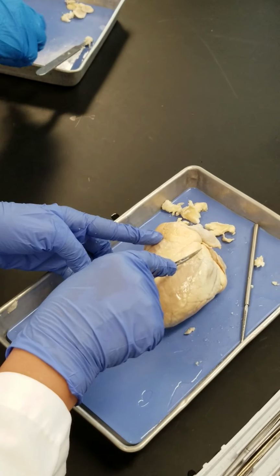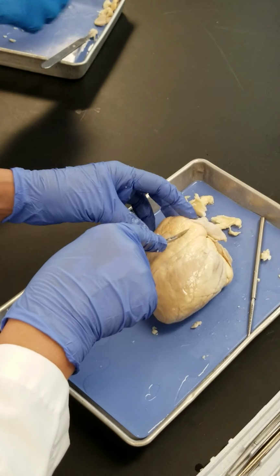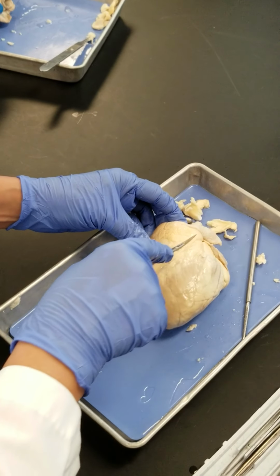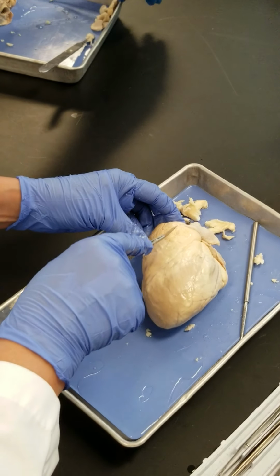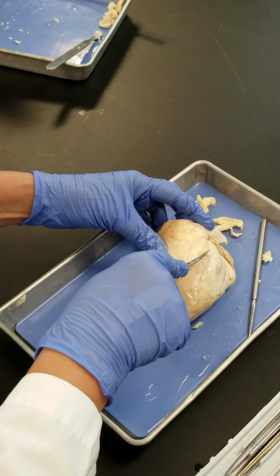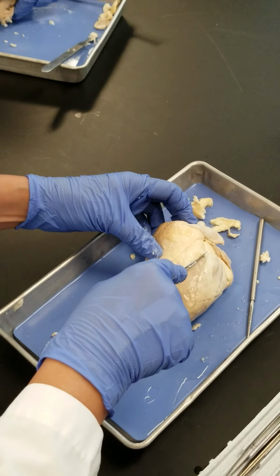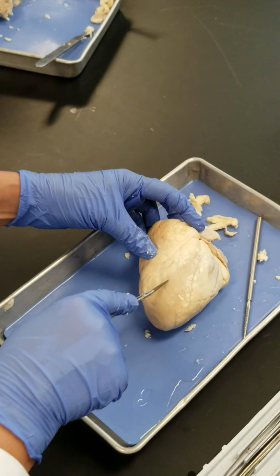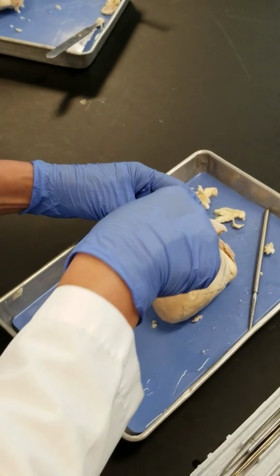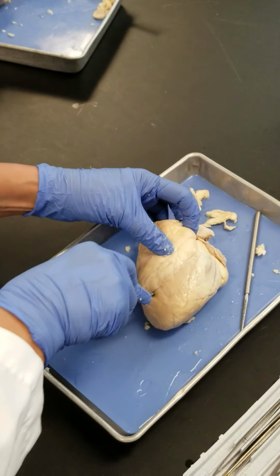So we can go to the right side of that, okay? We go just parallel, close to this one, but not very close. Or maybe go to the left side. To the left side, right? Go about half an inch toward the left side, and you go parallel to the interventricular sulcus, right? Just go deep, and you cut it, right?